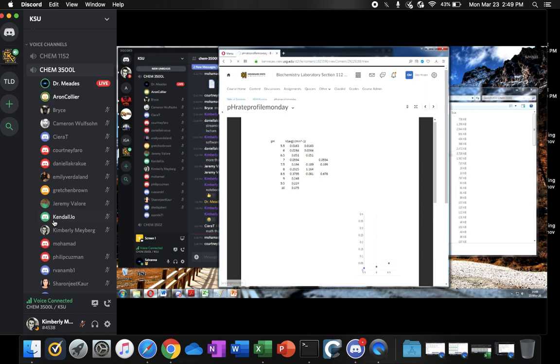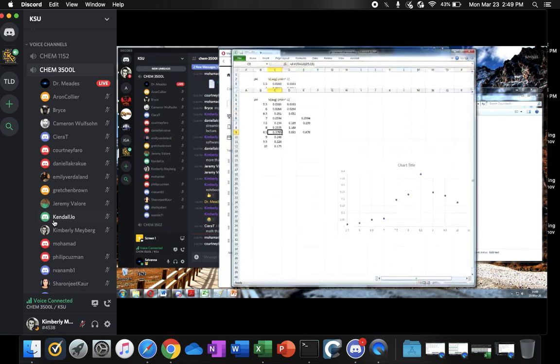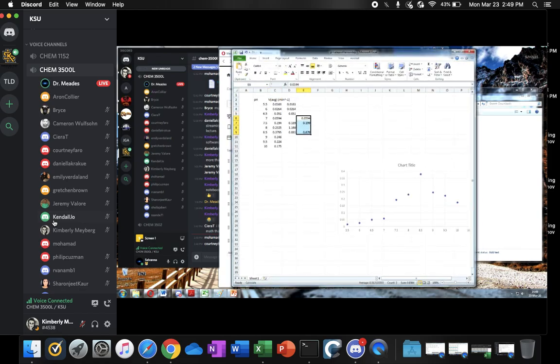I have no idea. Let me download it and take a look. These here? Don't know what those mean. It looks like this was a full set of data, so repeating their information here, and that looks like another copy of this. Maybe a third group did pH perhaps? Or, I see. Some groups only had one. Some pHs were done twice, and they don't agree very well. These two do not agree. So what do we do with that data?